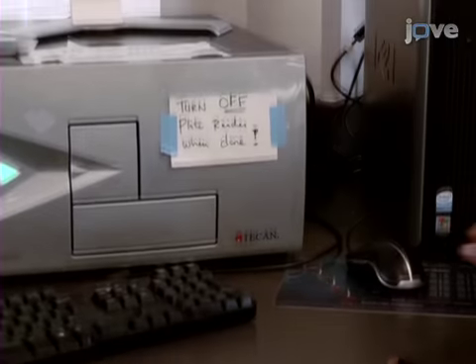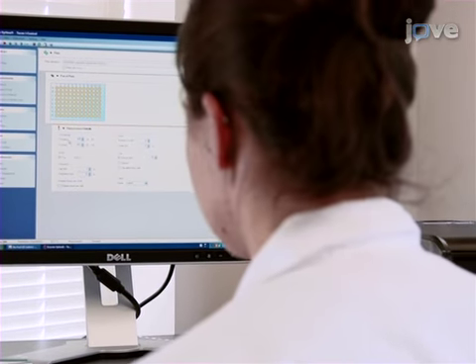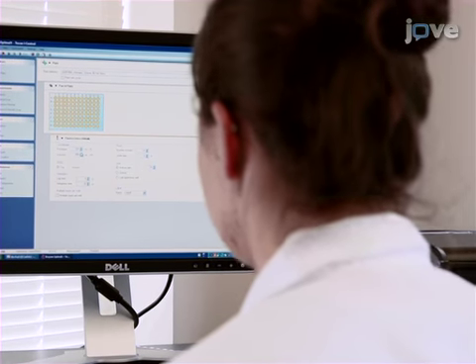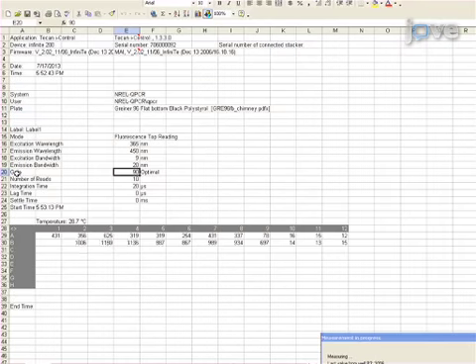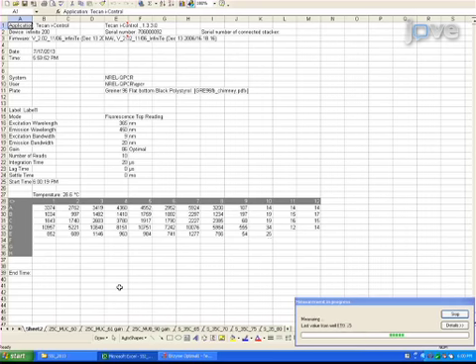Following manufacturer's instructions for the fluorometric plate reader used, set the excitation wavelength to 365 nanometers and the emission wavelength to 450 nanometers. Load one of the standard plates, set the fluorometer to automatic gain, and read the plate. Then, set the gain to manual, and decrease the value from optimal to the next lowest number, rounded to the nearest 5 for each standard plate. Repeat the measurement twice for each plate.